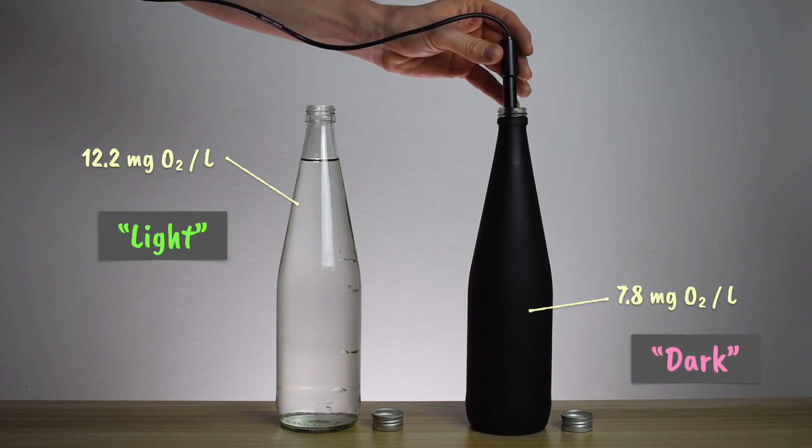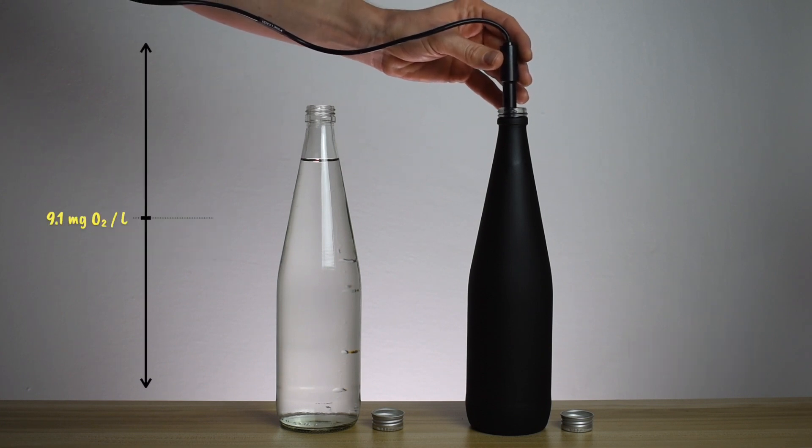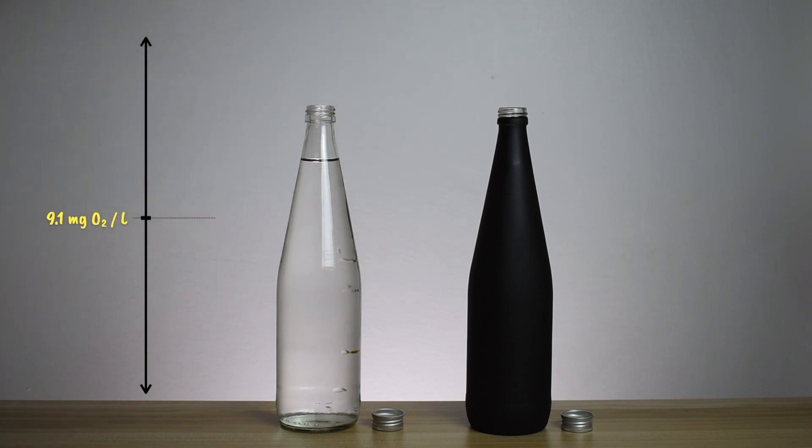So, we had an initial oxygen level in the bottles of 9.1. Oxygen was produced by photosynthesis, but also used by respiration, and we've measured 12.2. So, the change, 3.1 milligrams of oxygen per litre, per 24 hours, reflects the net primary productivity.